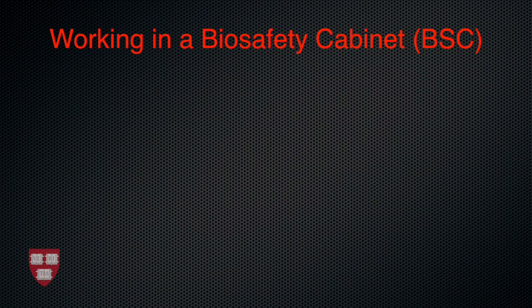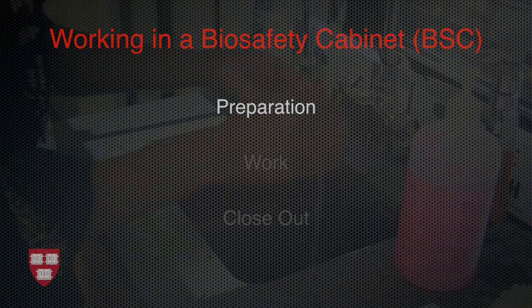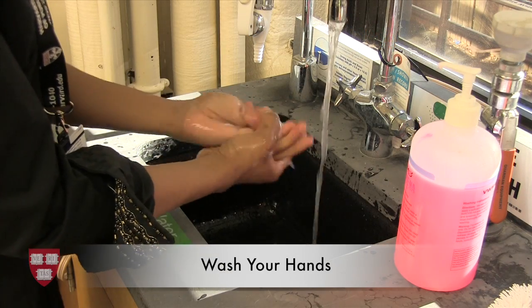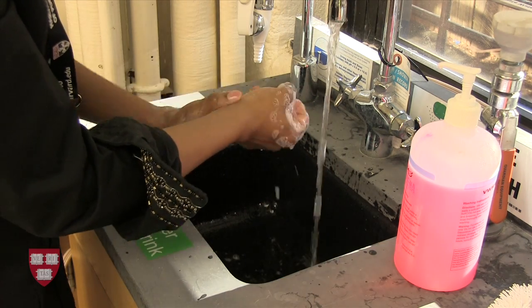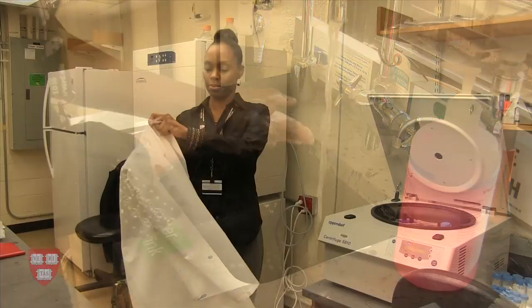When working in a BSC, your tasks fall into 3 phases: the preparation phase, the work phase, and the closeout phase. In the prep phase, you will prepare yourself and the cabinet for work. First, to prepare yourself, make sure you wash your hands. Hand washing protects both you and your experiments.